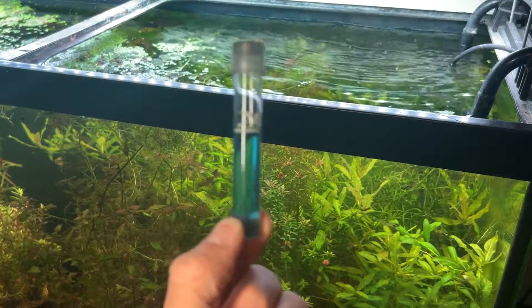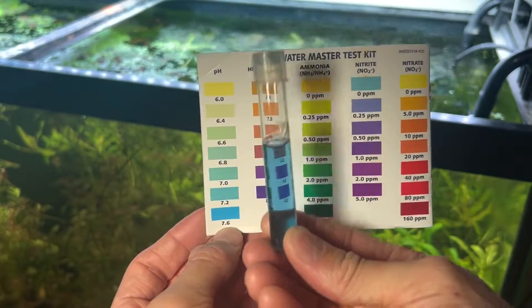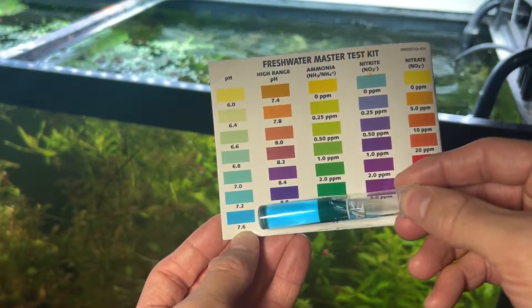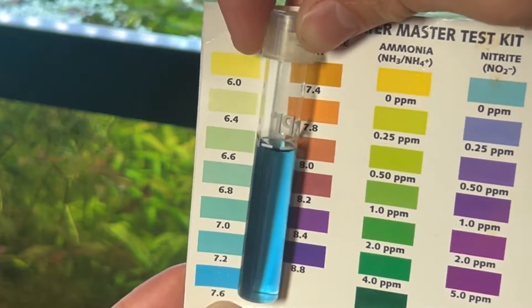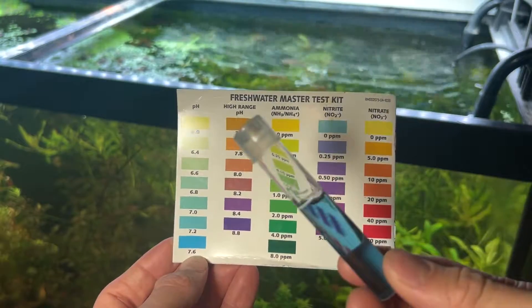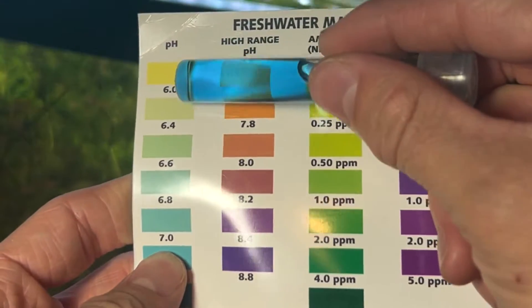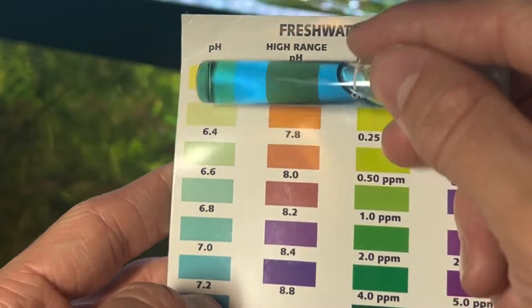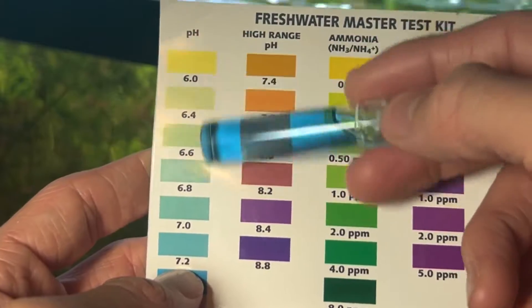Now that we have our reading, let's compare it to the chart. My water is already very alkaline, so it exceeds our regular pH chart — according to the graph it reads 7.6. If your reading falls within the lower range of the chart, you can read values like 6.0, 6.4, or anything in between, and accurately judge that your water is a little acidic if it's in that area.